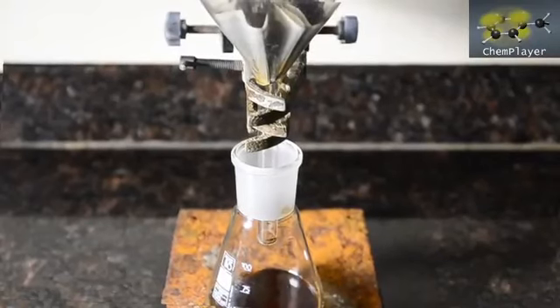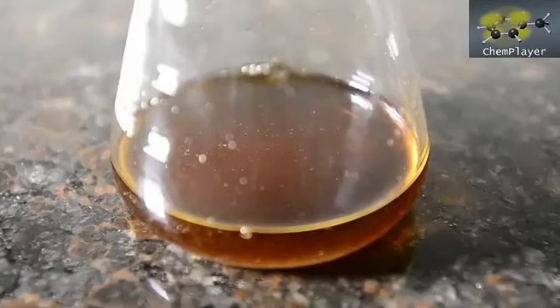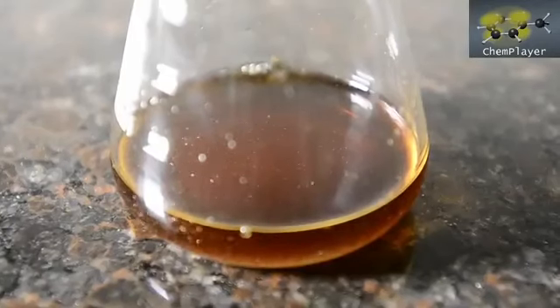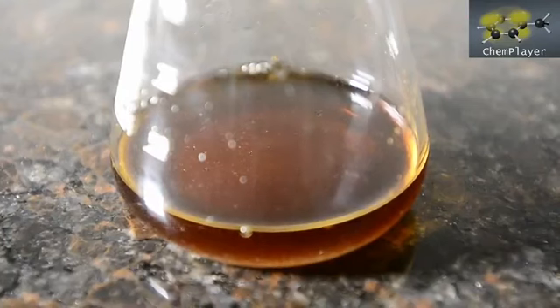And as the filtrate cools, we are actually getting little sugar-like crystals appearing. This is very roughly about the right solubility level for the alkali cyanide salts. Okay, so let's do the reaction and make the copper cyanide.